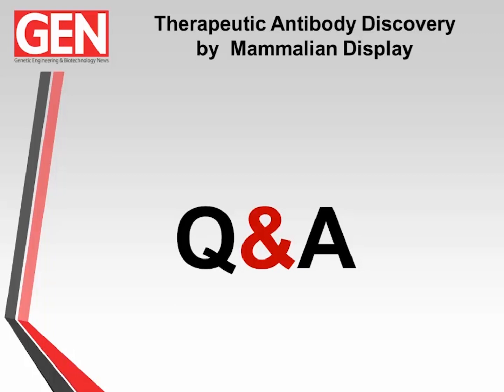The other thing I would say is it's particularly powerful for affinity maturation programs, since we can screen potentially all the variants within a library and at the same time distinguish between expression level and binding level and thereby infer something about affinity. So as far as affinity maturation goes, we think it's quicker and more powerful there as well.